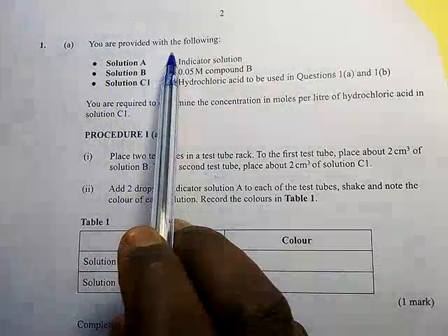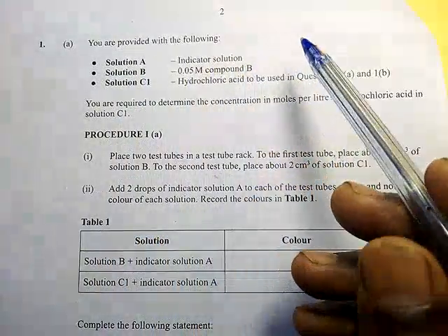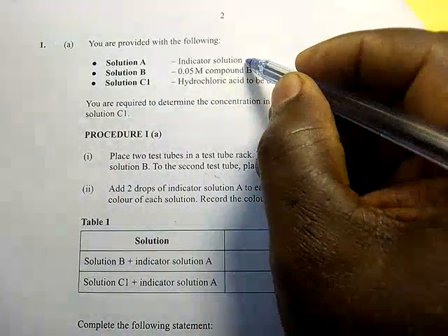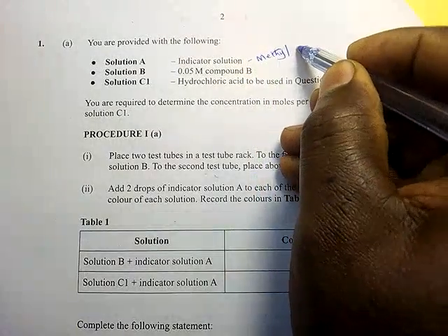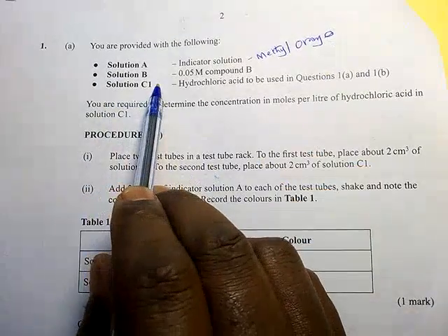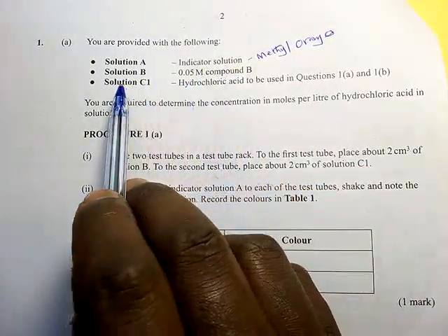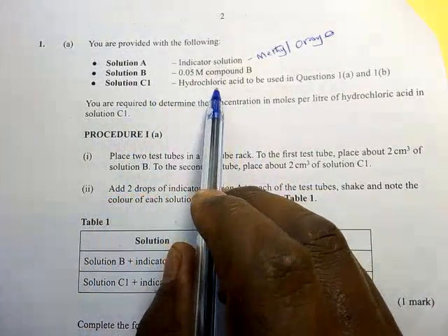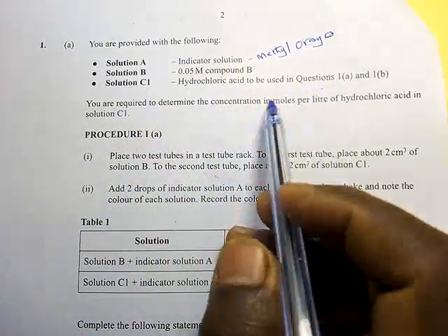You are provided with the following: solution A indicator. This was methyl orange indicator. Solution B, 0.05 molar compound B. Solution C1, hydrochloric acid, to be used in question 1A and B.